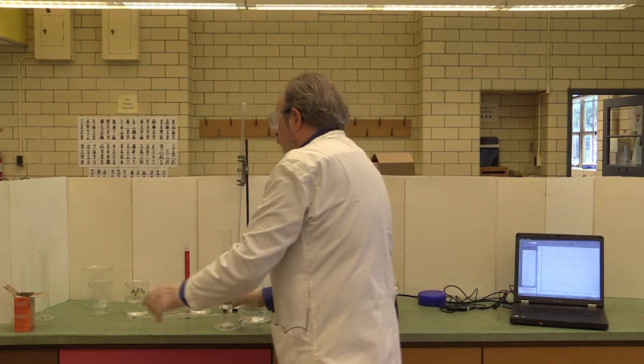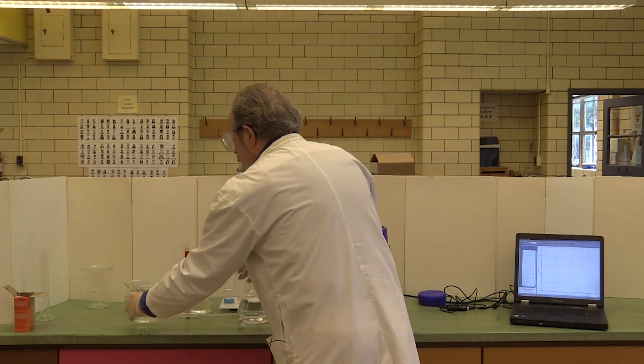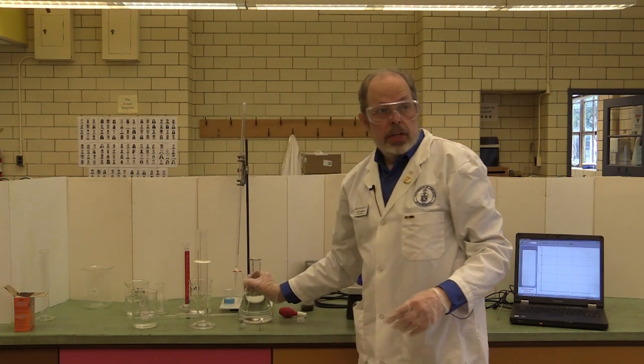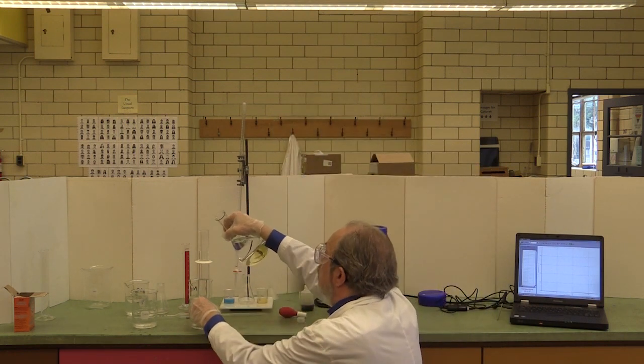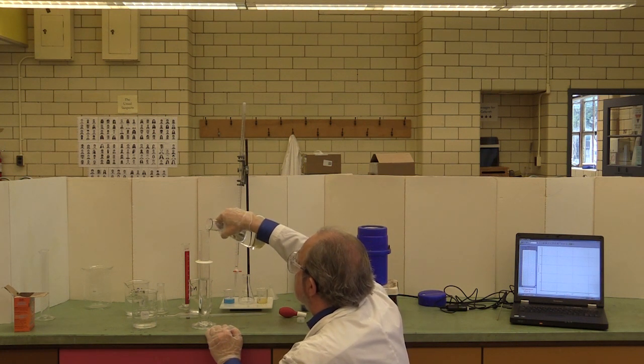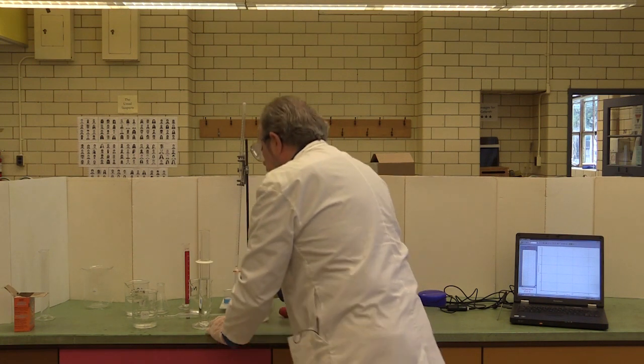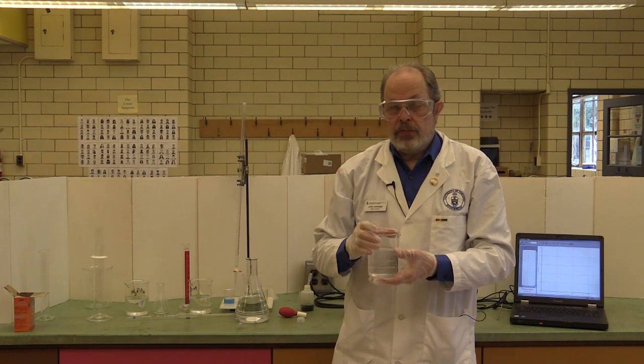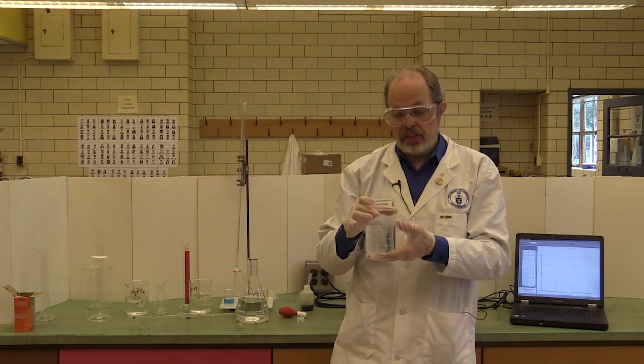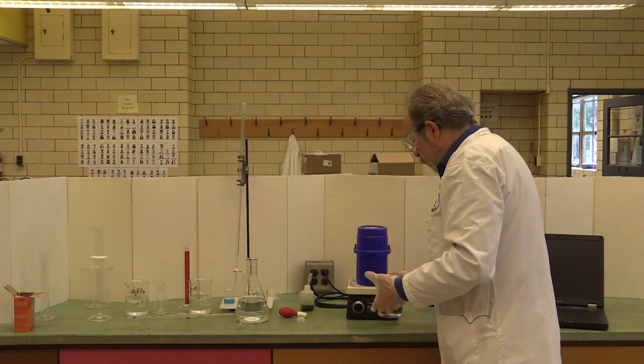That's 250. And I need to pour that into another dry beaker. And I'll need another 125 mils to make it up to 375 mils total. Got it. So now I have 375 mils of a sodium hydroxide solution that has the right number of moles to react with one of the phosphoric acid protons. We're now ready to actually do the calorimetry experiment.